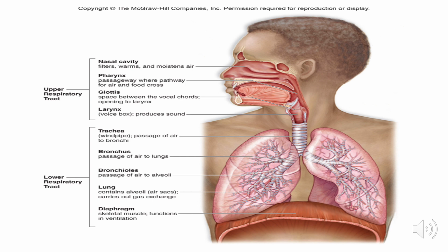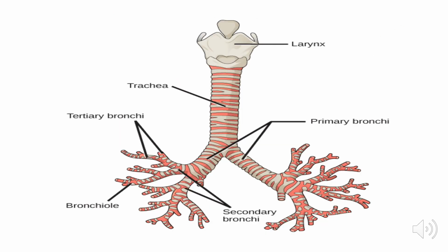We were able to also cover the trachea, which is one of the organs that belong to the lower respiratory tract. So for this lecture, we will be covering the remaining organs that belong to the lower respiratory tract. Pointed by the blue arrow is the trachea. At the level of the sternal angle, the trachea will bifurcate to form the two primary bronchi.